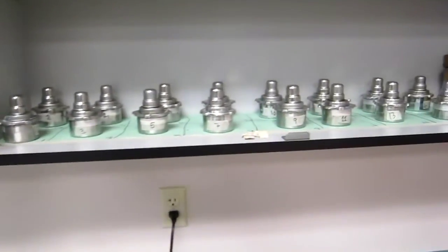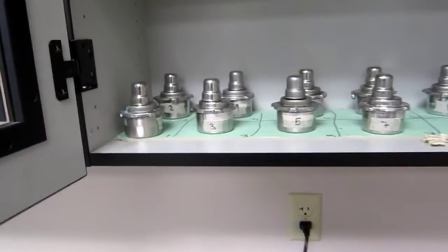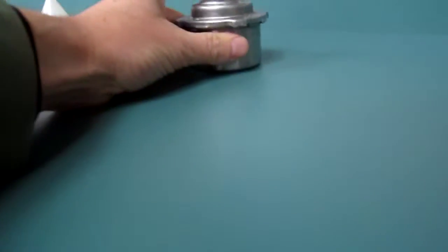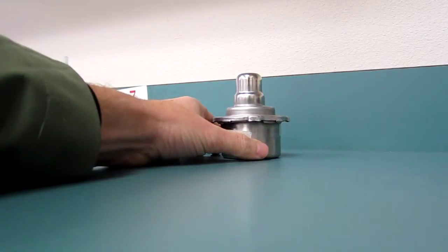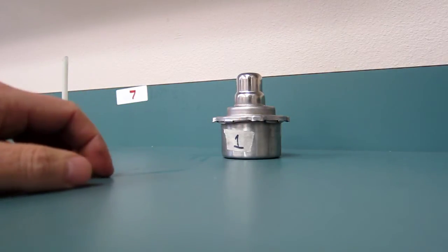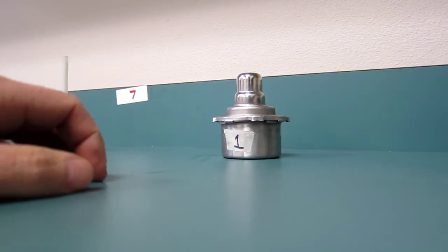Alcohol burners. Alcohol burners are in here. Get the one that belongs to your table number. So for example, here's table one right here. Pull that down. Okay. A couple things about alcohol burners. Alcohol is flammable. That's why we use it. So you need to be careful.